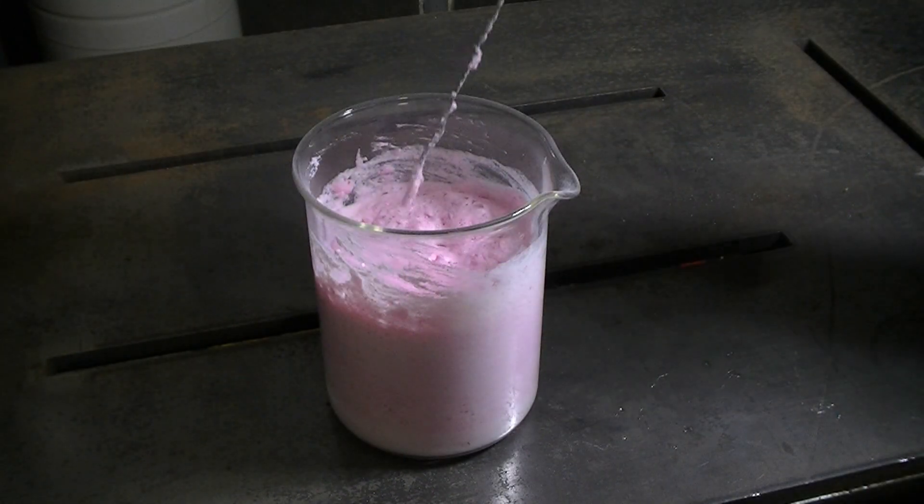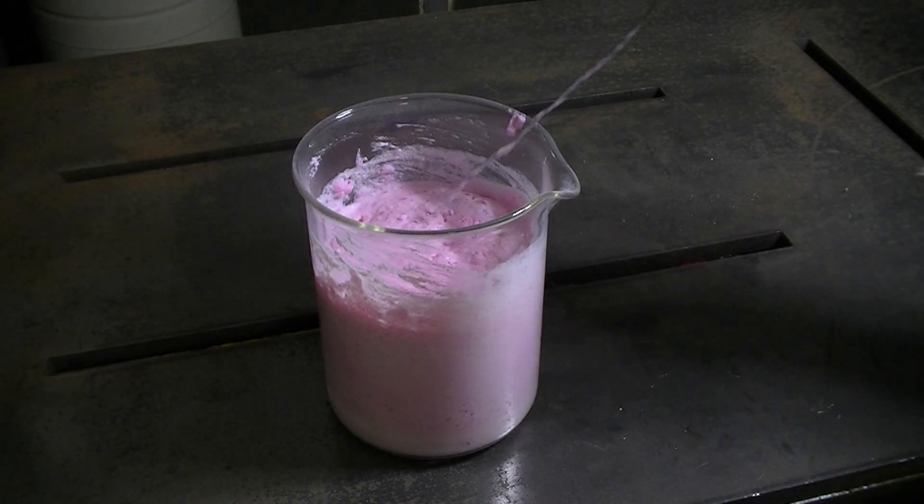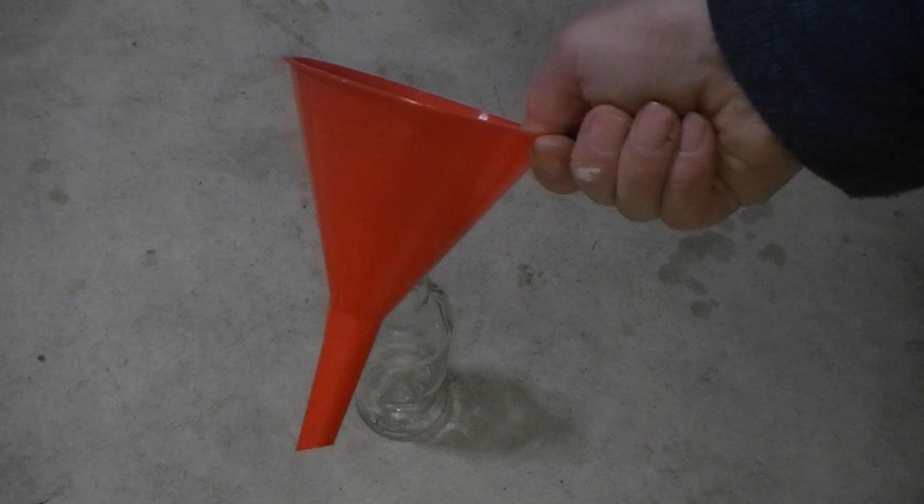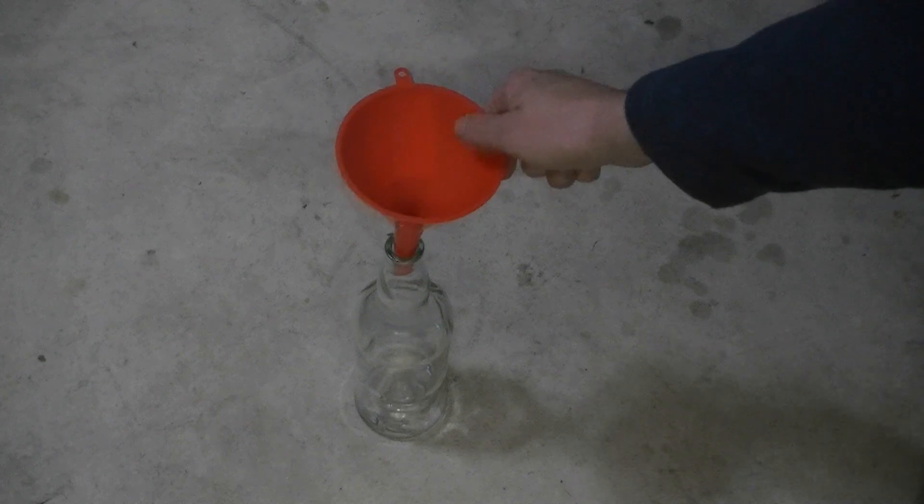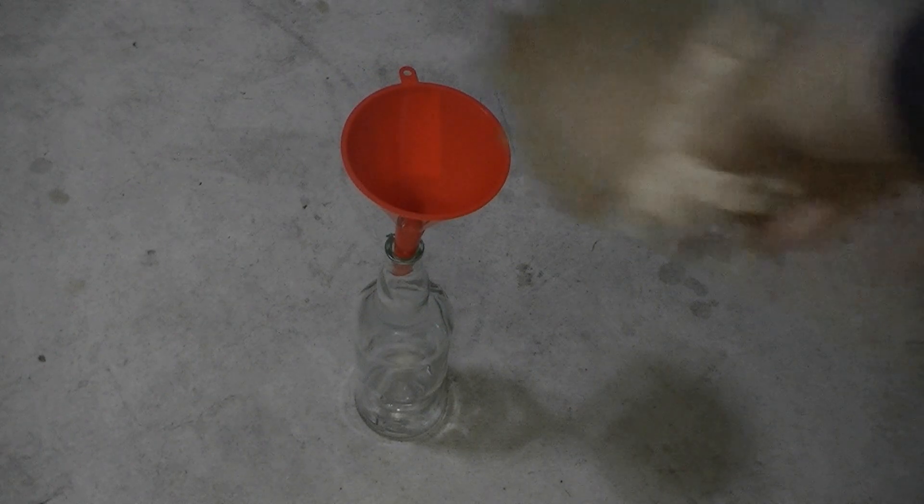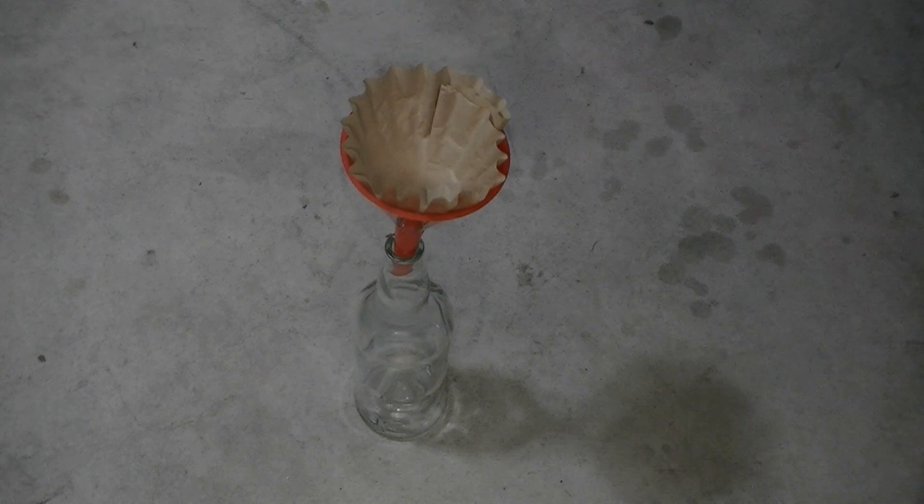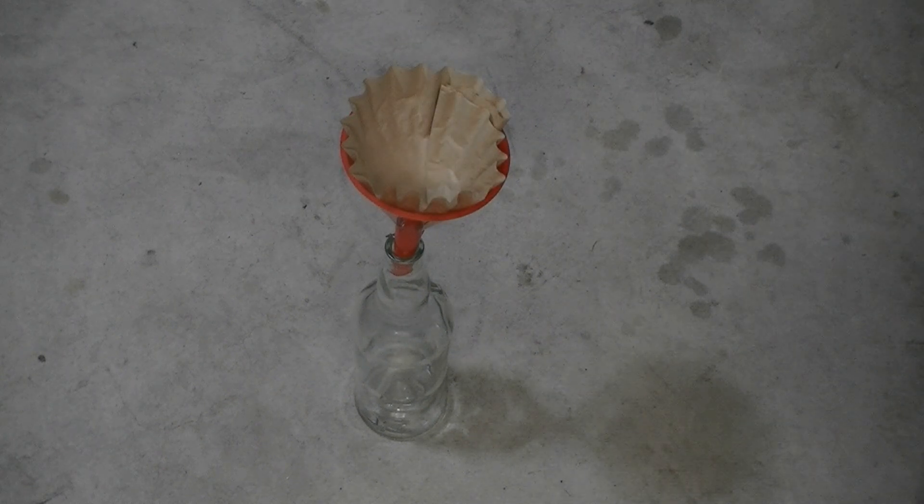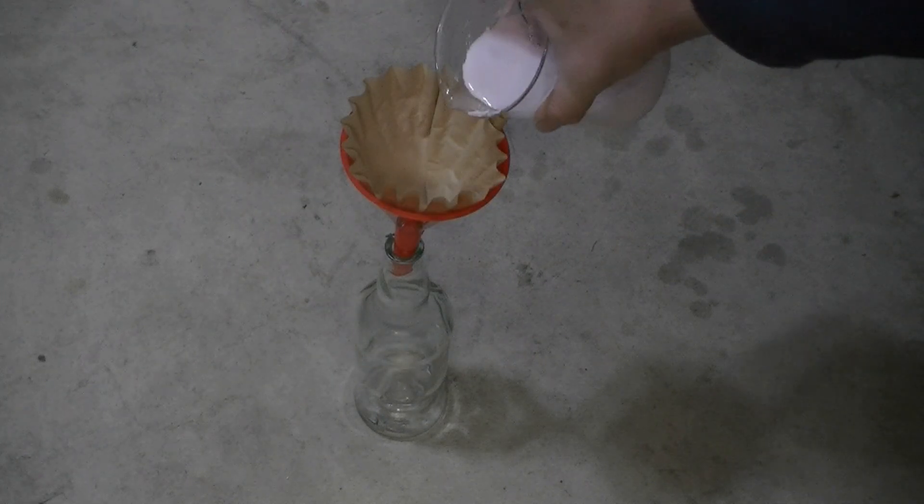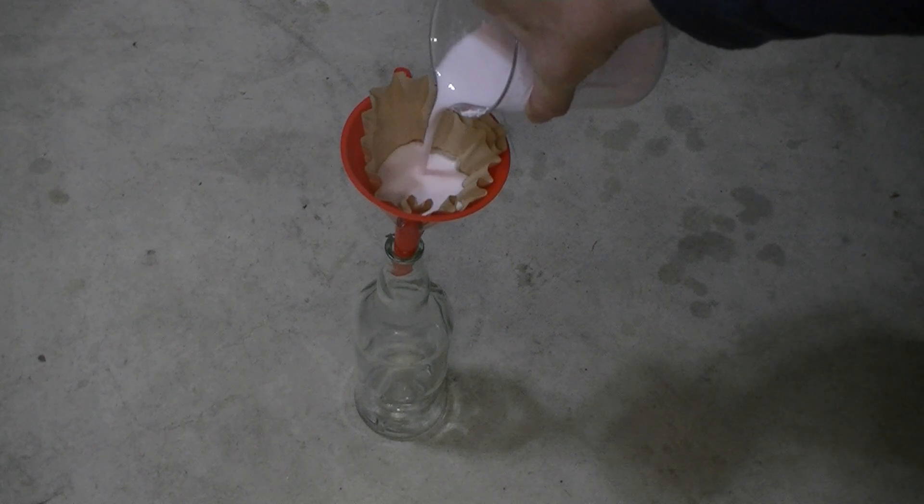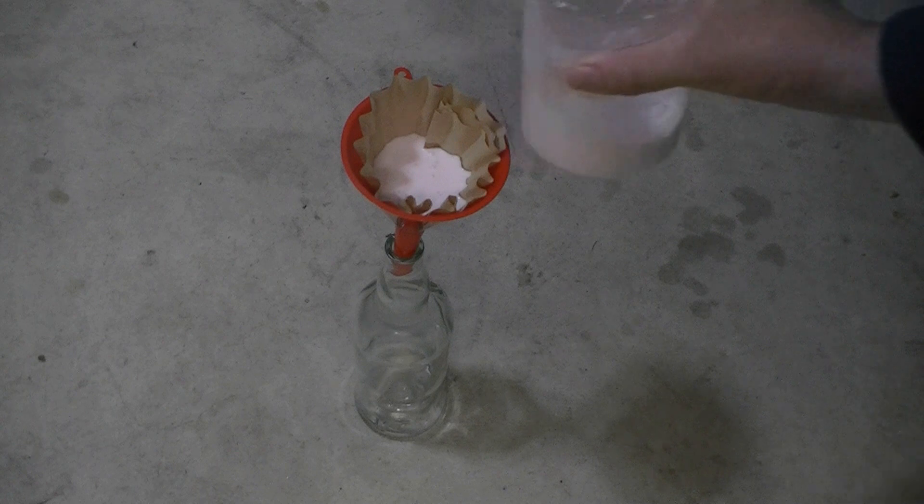So let the reaction sit overnight. The next phase now is to filter the solution. We use a funnel and we're going to use a coffee filter paper. Then we pour our solution through the filter, and the bismuth chloride should go through the filter as it is aqueous in the solution, leaving behind the leftover products, probably including a lot of starch.